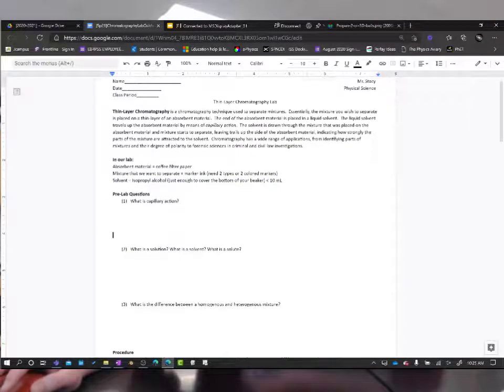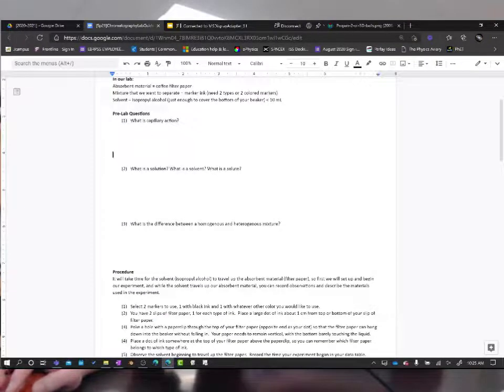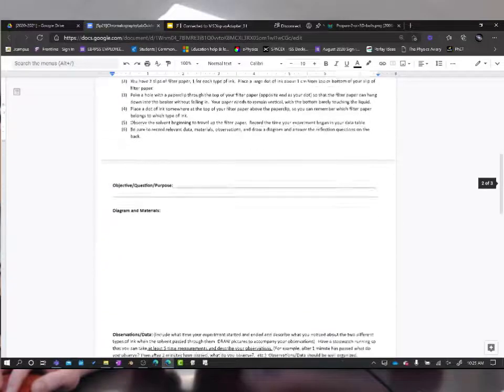Make sure you answer the pre-lab questions. If you need to look some of this up, go on ahead and do so. You might find it in the text, the presentations, or you can use the internet with reliable sources to answer those. The procedure is listed here in listed steps, primarily for people doing this in class, but make sure you read through that to understand what steps I'm actually going through.